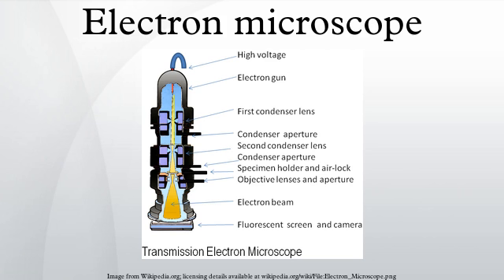Another advantage of SEM is its variety called environmental scanning electron microscope, which can produce images of sufficient quality and resolution with the samples being wet or contained in low vacuum or gas. This greatly facilitates imaging biological samples that are unstable in the high vacuum of conventional electron microscopes.